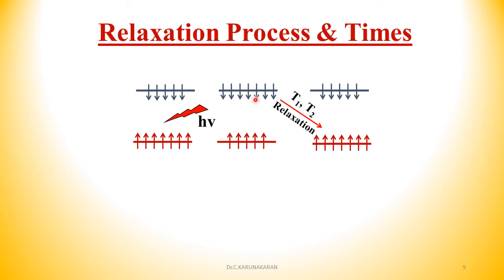The excited state is more populated than the ground state. Therefore, there will be no absorption. There will be absorption of RF radiation only as long as there is a population difference between the ground state and excited state.